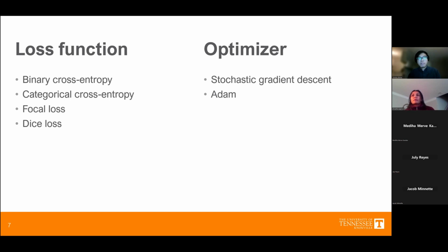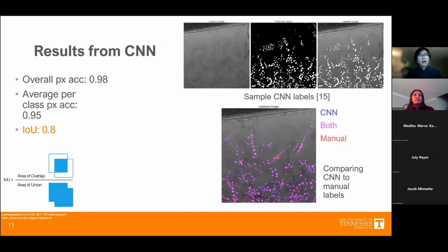So yeah, I think binary cross entropy is just in general recommended. In your images that you have trained, can you point out what is false negative in your image? Do you have any example where you can point it to me where is false negative? So this is a false negative. Where is that? So let me get a pointer.